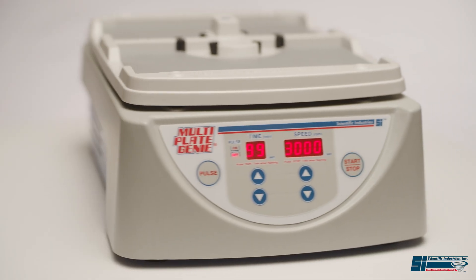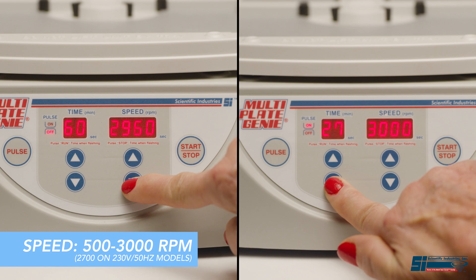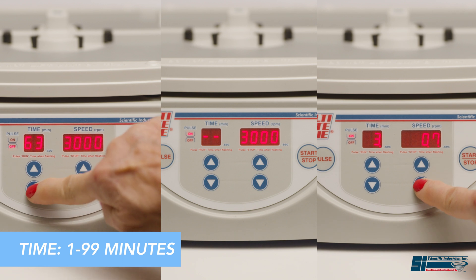The MultiPlate Genie is fully programmable. Adjust the speed and time ideal for your samples. Set the program for timed, continuous run, or interval mixing.